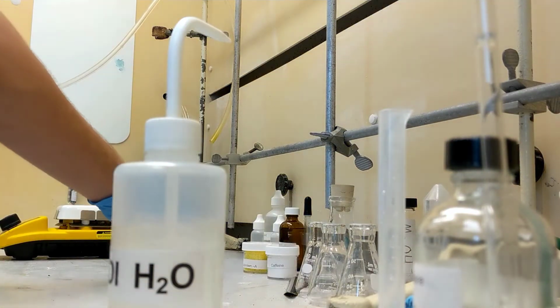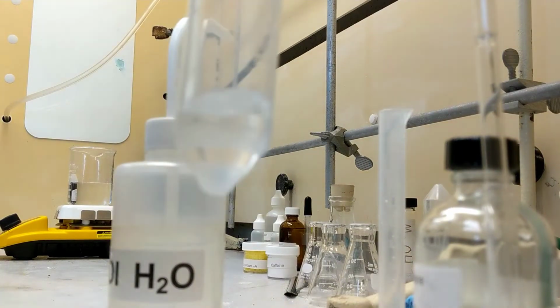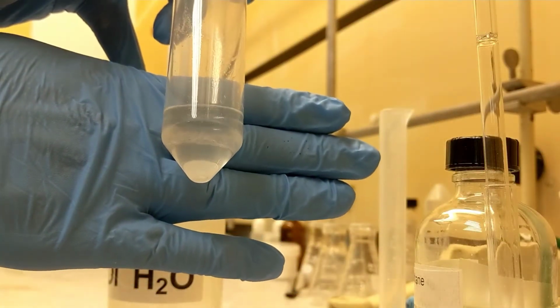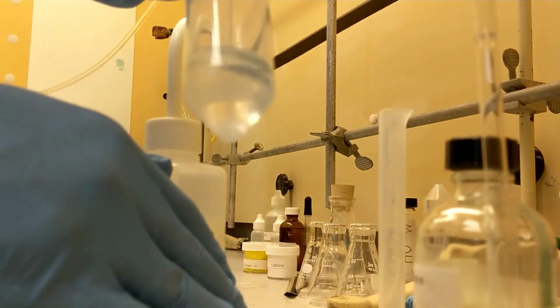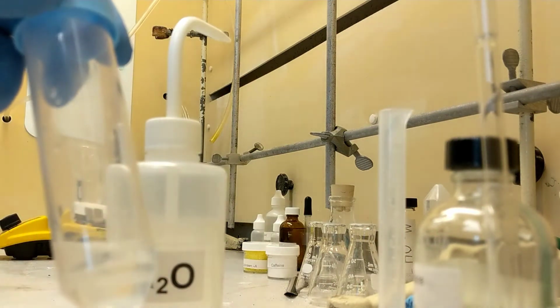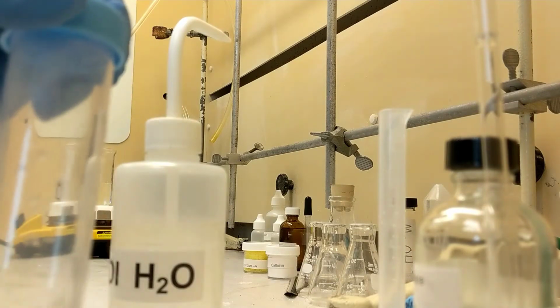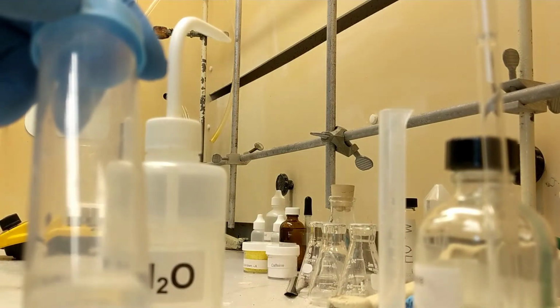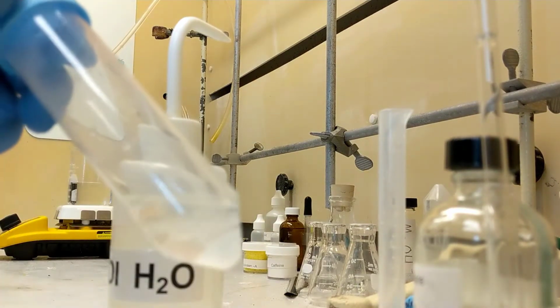So right here in the centrifuge tube, you can see 2 layers. Hold on, let me help you out. Yep, there we go. You can see 2 layers. So I'm just going to shake this until it's fully dissolved. Then I'm going to extract the organic into an Erlenmeyer flask, dry it, put it in a test tube, evaporate off the methylene chloride, and then we'll see what's in it. Alright, I'll see you guys after I finish shaking this.